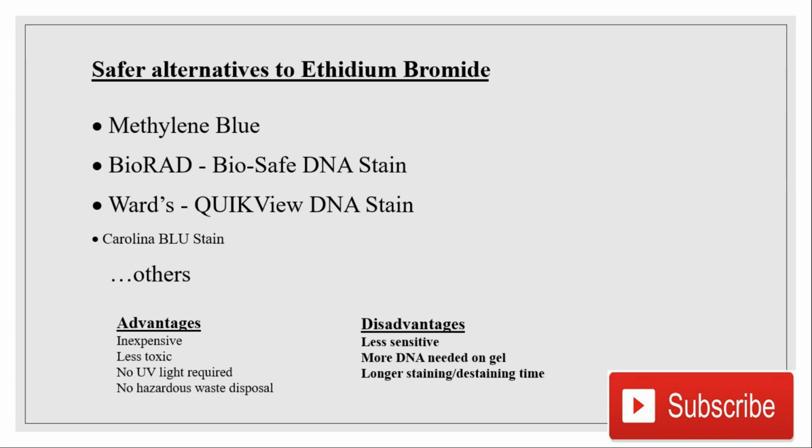Also, every staining material has advantages and disadvantages. Advantages: inexpensive, less toxic, no UV light required, no hazardous disposal. Disadvantages: less sensitive, more DNA needed on the gel, longer staining and de-staining time.